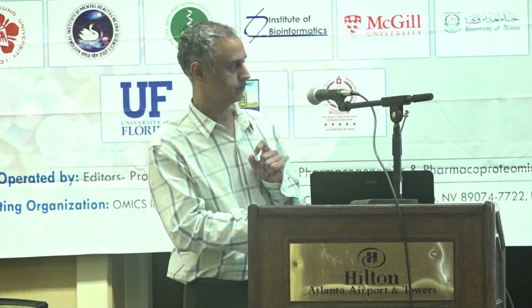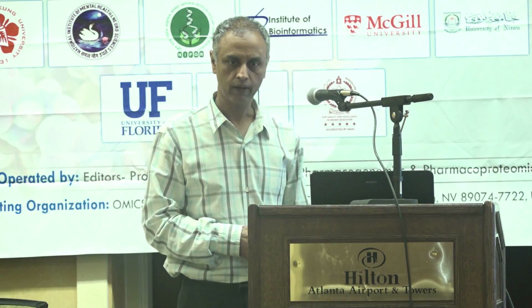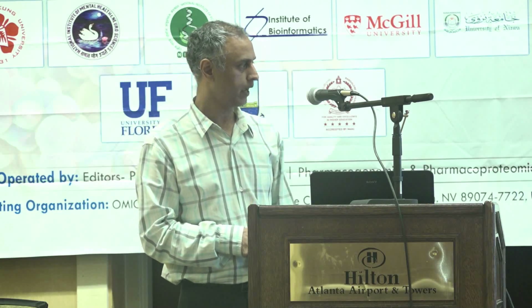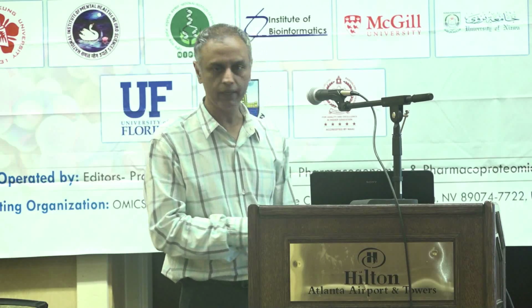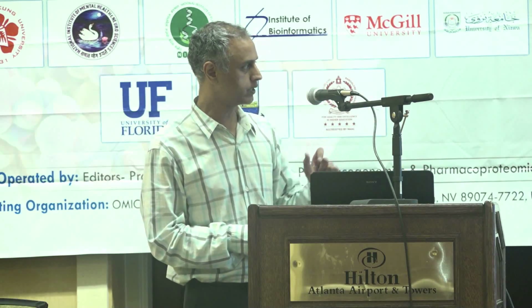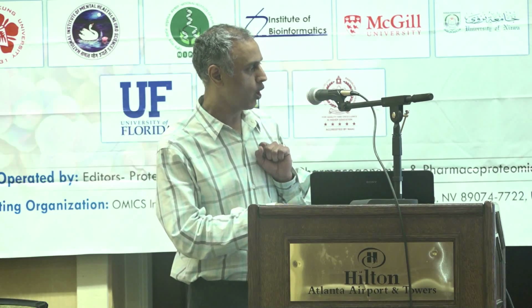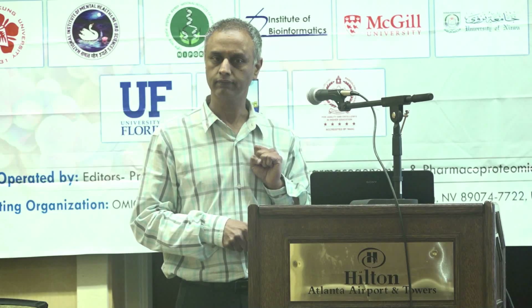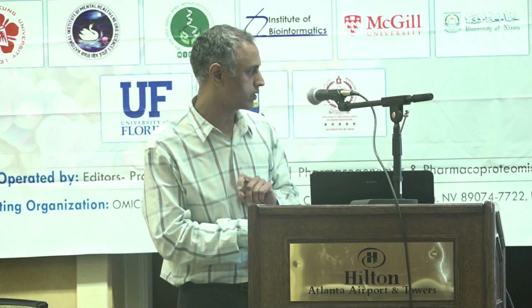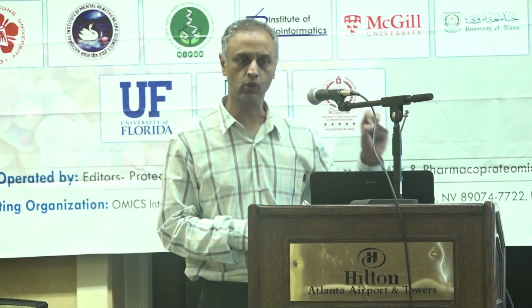Remember this one here. We had this that did not map to Klebsiella at all. This was even more confusing. So we went back to them and said, what is happening? Because when we then search against all the bacterial species, we see that this is one category of E. coli. So here, we have 90% coverage, and this is classified along with some of the other known disease-causing E. coli.